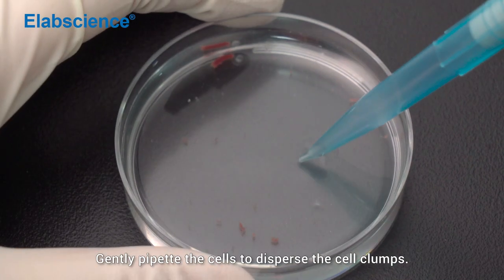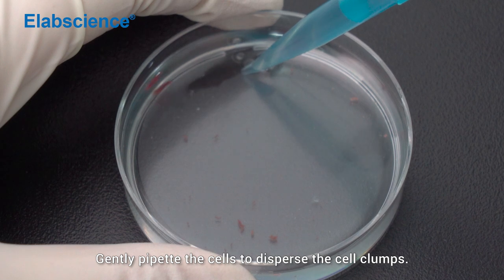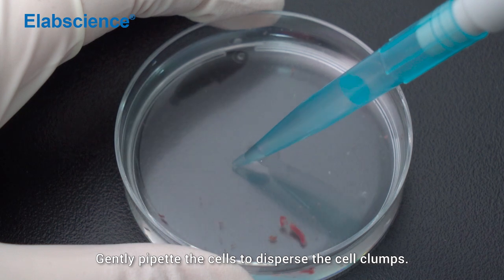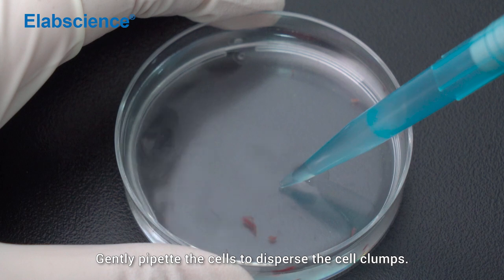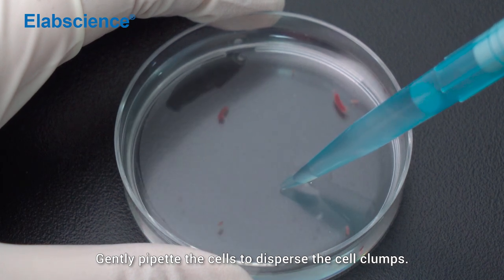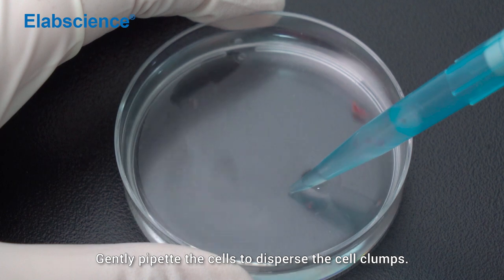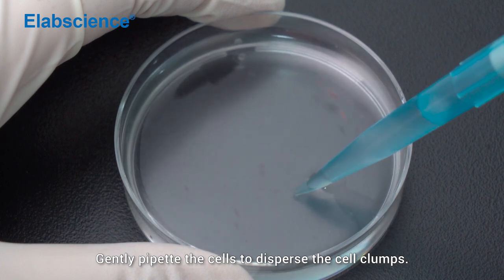Gently pipette the cells to disperse the cell clumps.